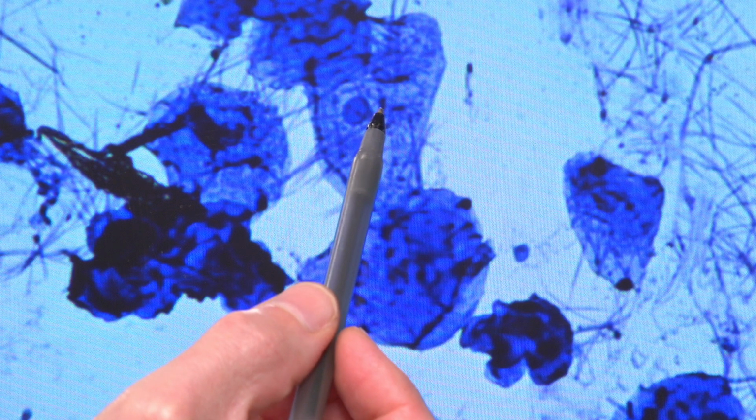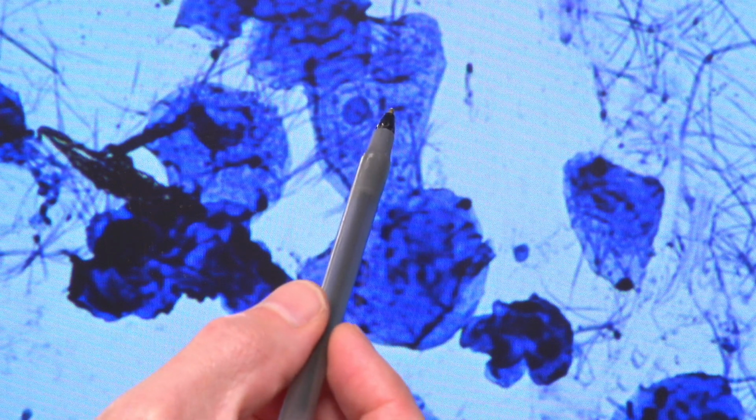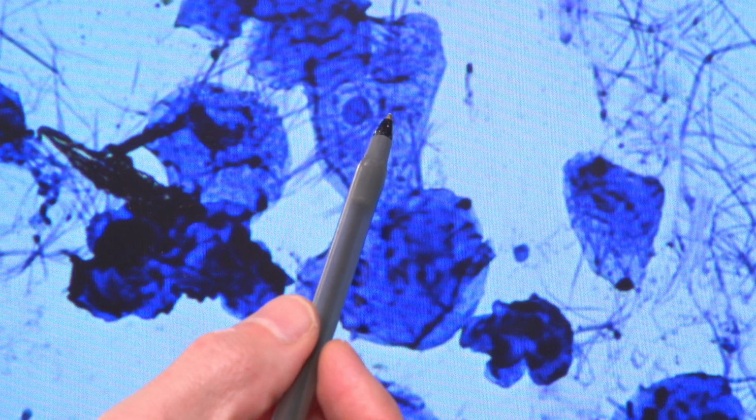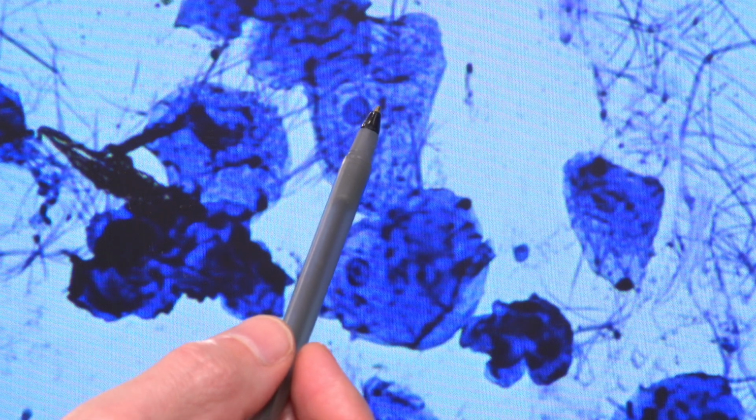some of these dots, and that's where I've got a little bit of an advantage here, right? So when I look at, for example, those dots right there, that and this, those to me look like they're bacteria stuck on your cells. Now, how would you know that? I mean, I'm telling you that this is garbage, that's garbage, this is garbage. How are you supposed to figure out that that's not garbage? Well, that's what the video is for, to kind of clue you in on it.